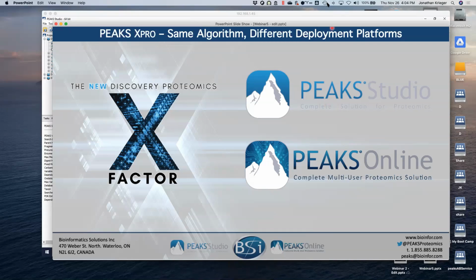But PEAKS Studio does allow you to visualize it slightly better. The advantages to PEAKS Online are that it's linearly scalable and it's faster to analyze the data. And one of the features that I really like is that it allows you to add files on the fly as you're going. So you can add a new file or remove a file, and really the whole analysis doesn't have to take place again. Only the latest change has to be processed.